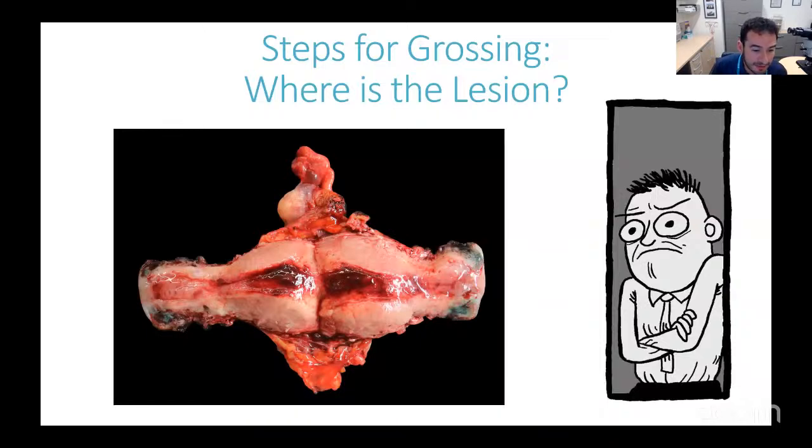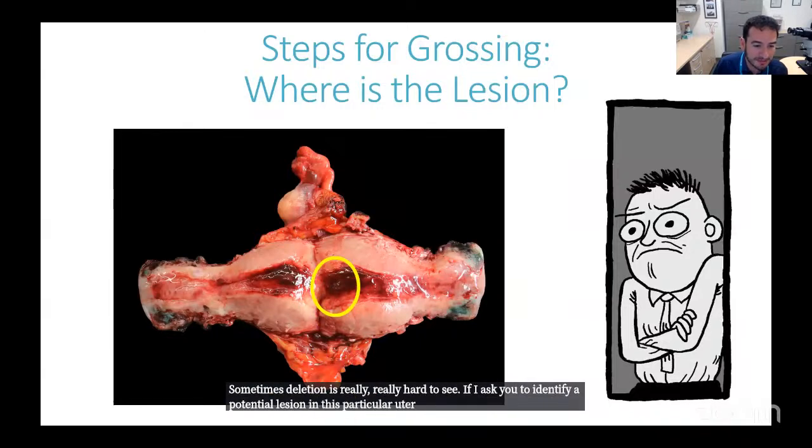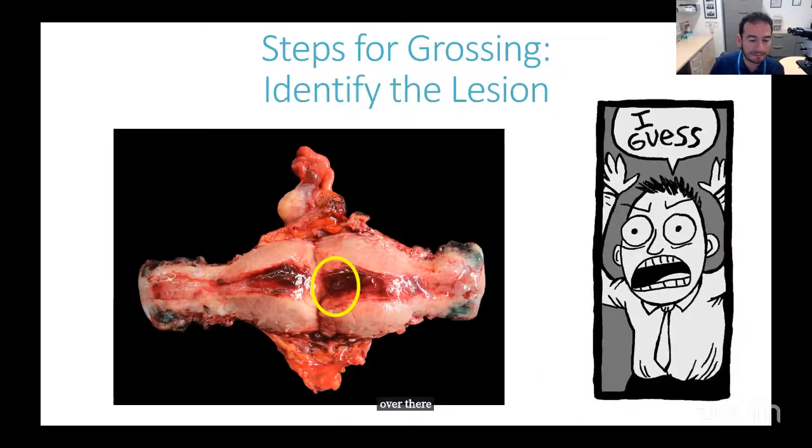Sometimes the lesion is really, really hard to see. If I ask you to identify a potential lesion in this particular uterus, and I tell you it's over there, my residents usually say, well, yes, I believe you, but sometimes it's not that obvious.